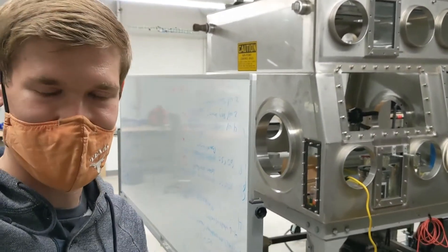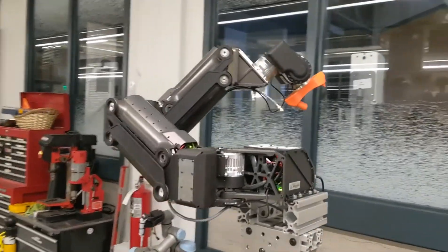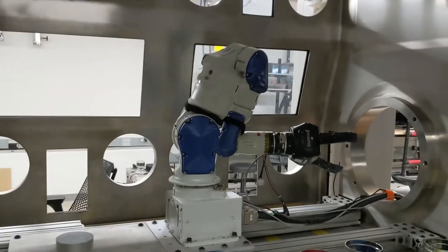Hi, my name is Mark Jennings, and I'm a master's student at the Nuclear Robotics Group, and this is my robot, Scorpio. Scorpio is a robot arm, or a manipulator, much like this manipulator in our glove box.